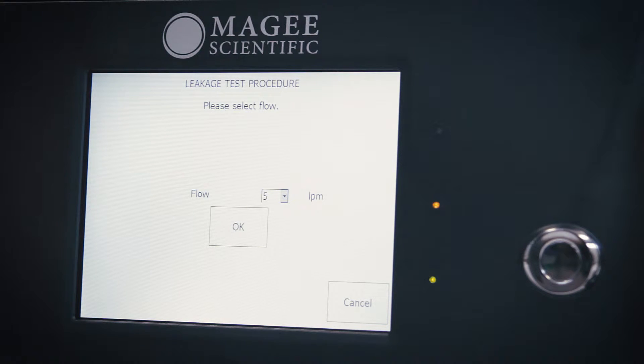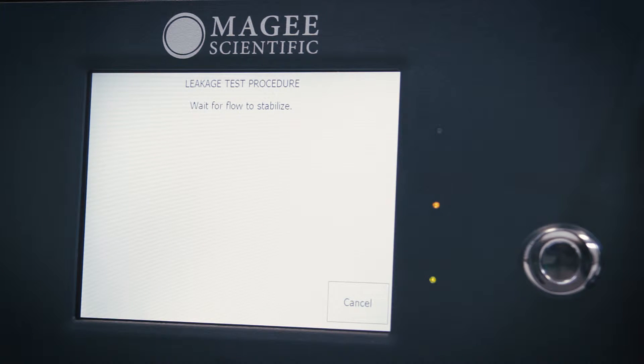Choose the flow at which you want to perform the test. Normally, this test is conducted at 5 lpm.